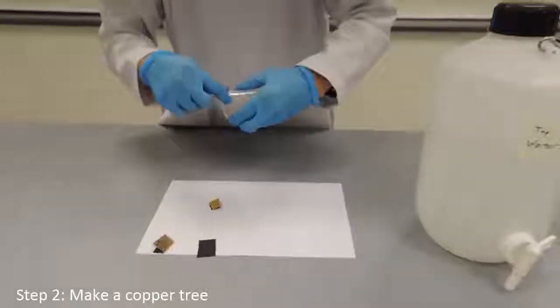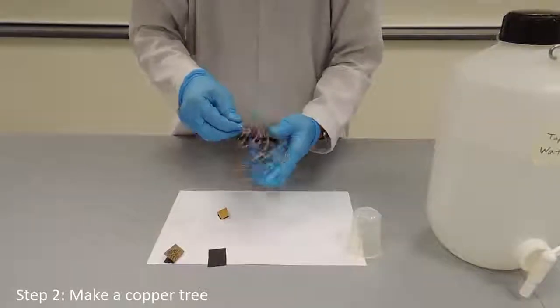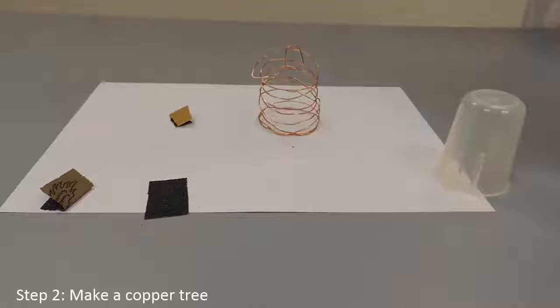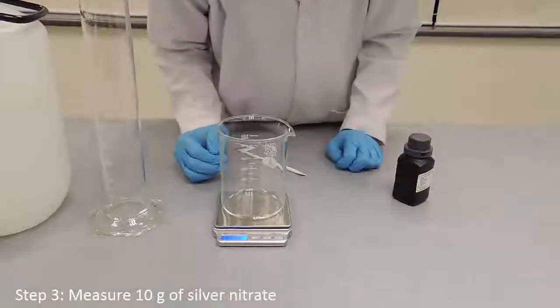The second step of the experiment is to shape the wire into a tree. This step can be done with the use of a small beaker or free hand. The next step of the experiment is to measure 10 grams of silver nitrate into the beaker using a weighing balance.